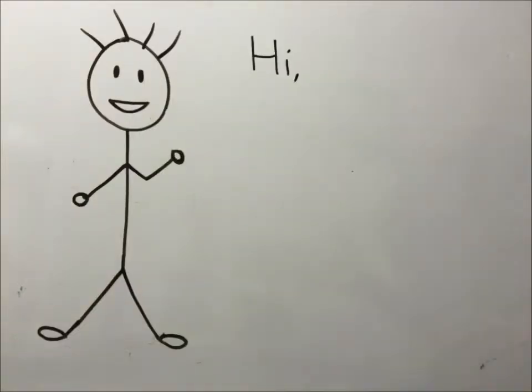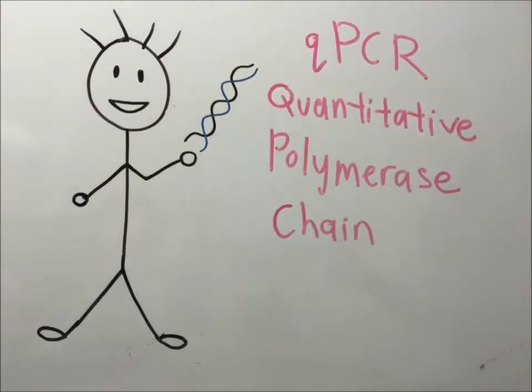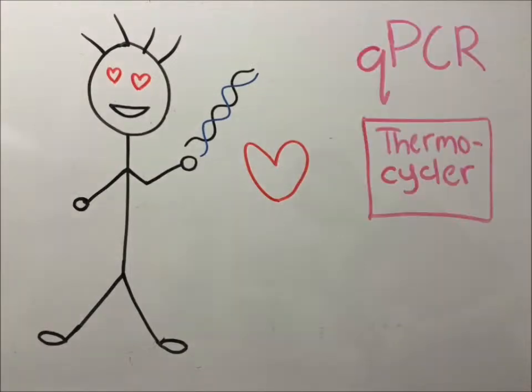This is Tom. Tom likes molecular biology and he has a DNA sample. Tom knows qPCR is a fast and sensitive tool he can use to quantify his DNA without having to do a post-PCR gel analysis.